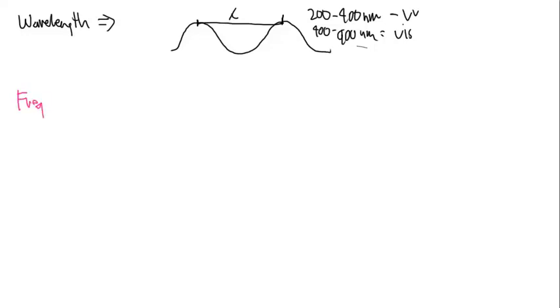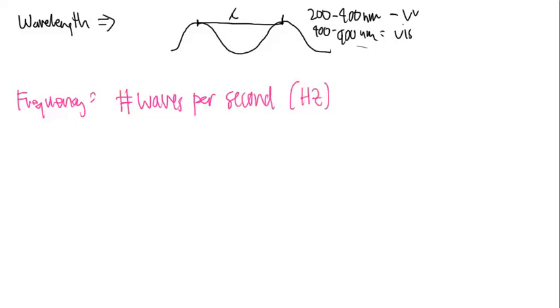So just a quick review, frequency is the number of waves per second. And this has a unit called hertz, just like the car rental place, Hertz. So frequency is going to show up as well. It's the same definition that we used for UV Viz. So if you learned it back in the day, it's the same definition that's used in infrared spectroscopy as well, just like wavelength is. The same definition that we used in UV is the same definition in infrared.